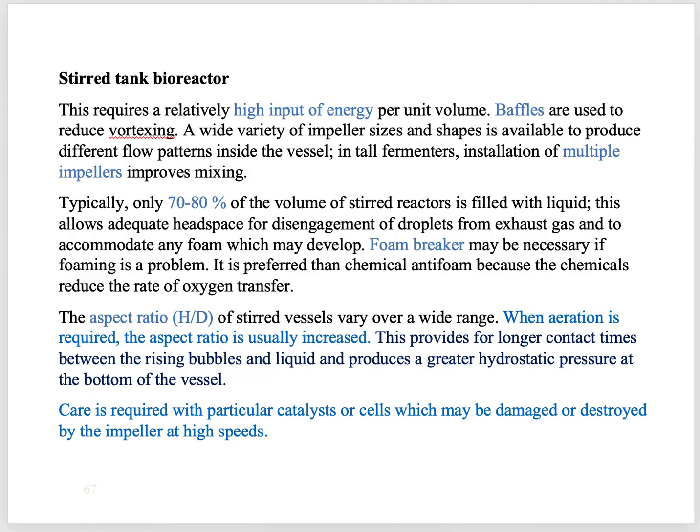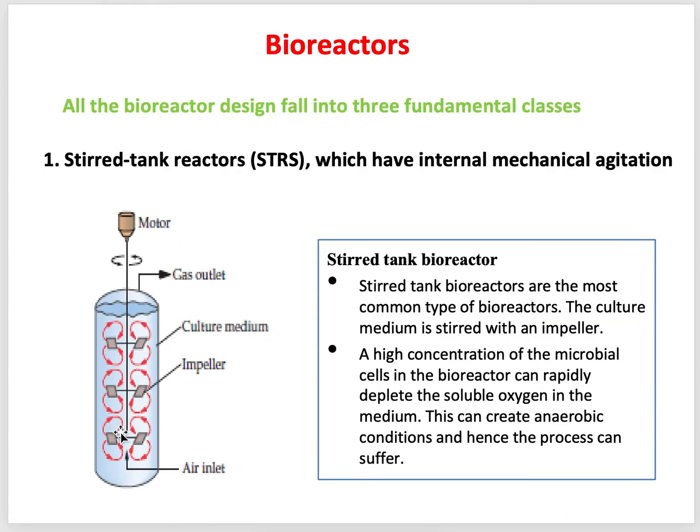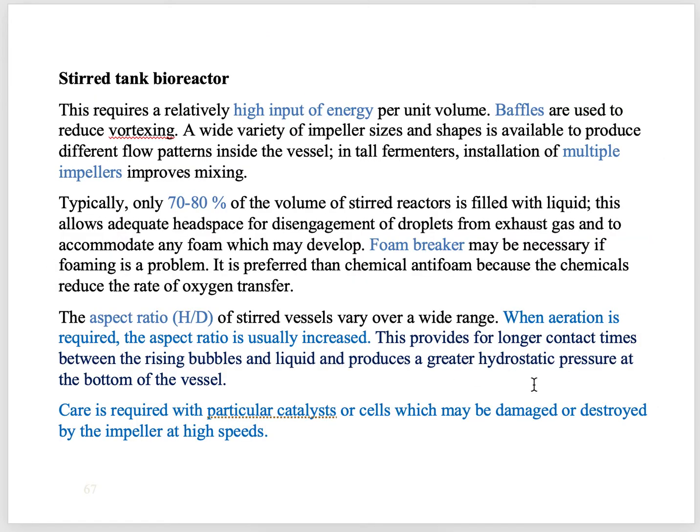Some more information about stirred tank bioreactors, which is good to know. Stirred tank bioreactors require a high input of energy because we have to stir mechanically. We have to use a motor and mechanical stirrer, so they will definitely require some energy.